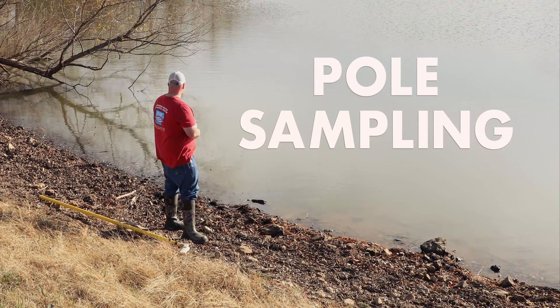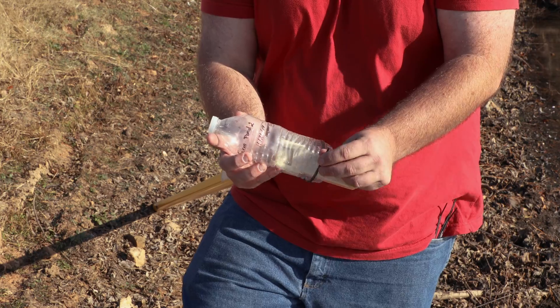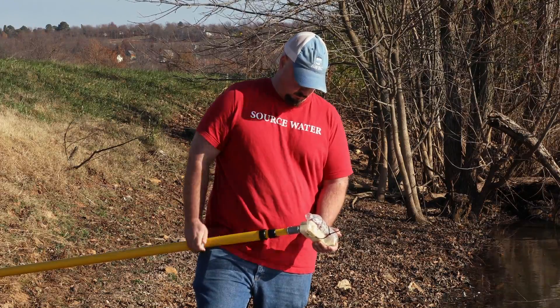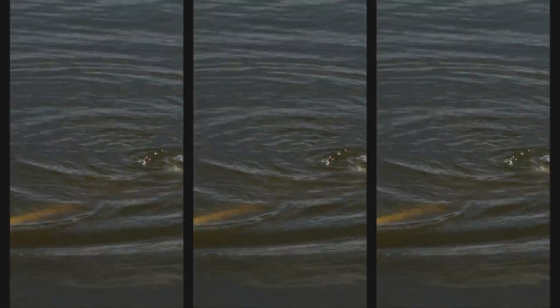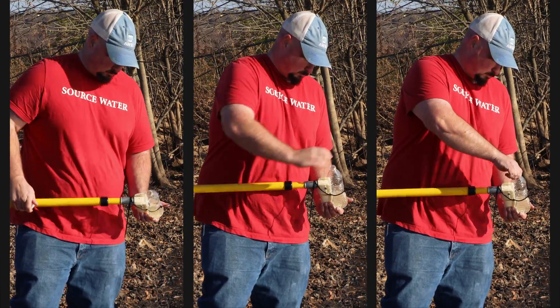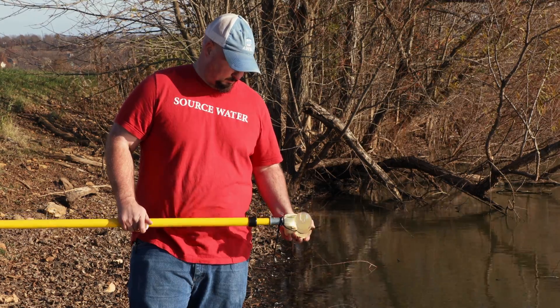If you don't have access to a boat or are unable to enter the pond to reach an acceptable sampling location, it is also possible to attach your sample bottle to a pole to collect your water sample. Any pole that's long enough to reach your sampling location will work, even a broom or rake handle. Simply follow the same steps: perform the triple field rinse, and fill with water from 6 to 12 inches below the pond's surface or midway between the surface and bottom, leaving about 1 inch of head space.